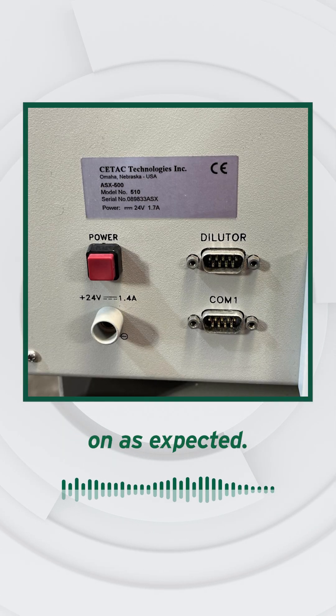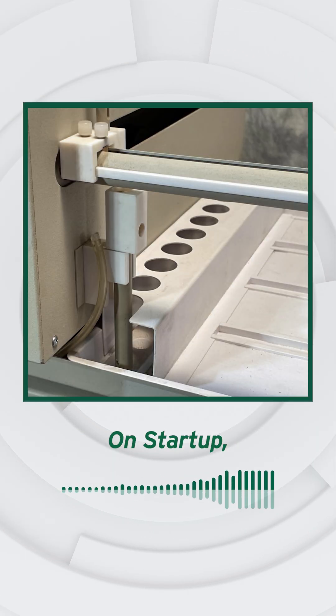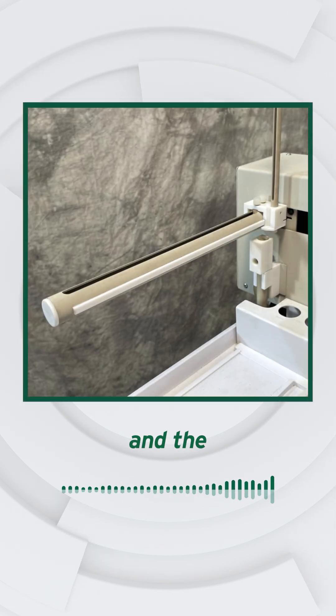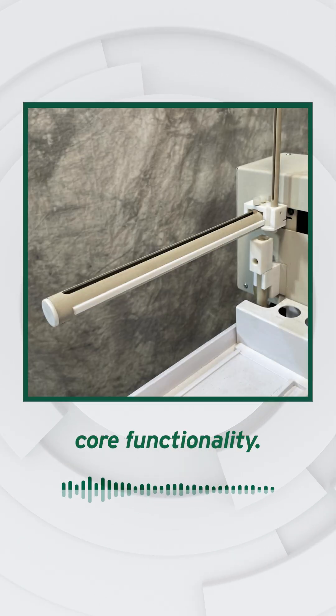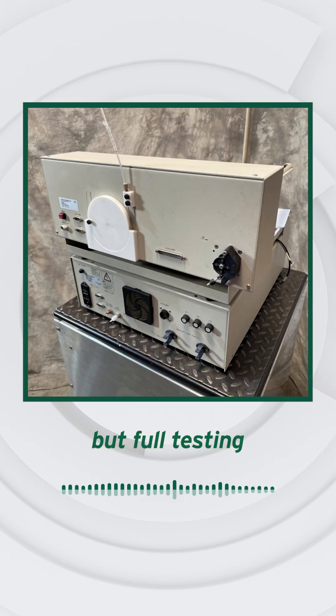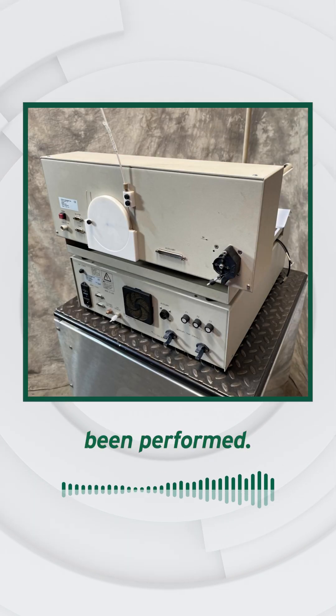The system powers on as expected. On startup, the Auto Sampler homes and the analyzer powers with the lamp active, confirming core functionality. It appears intact, but full testing hasn't been performed.